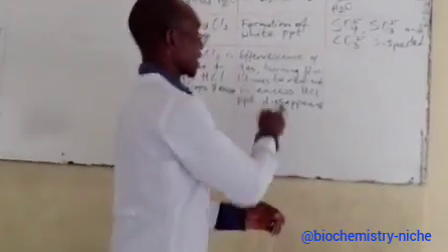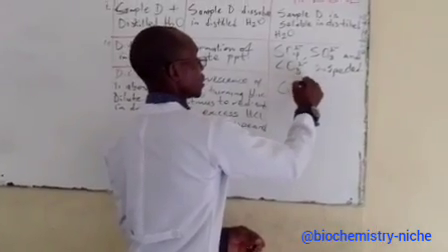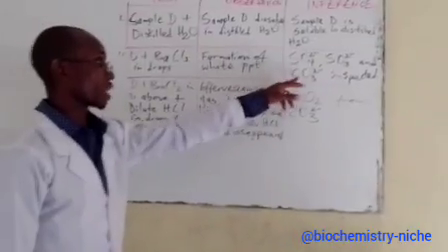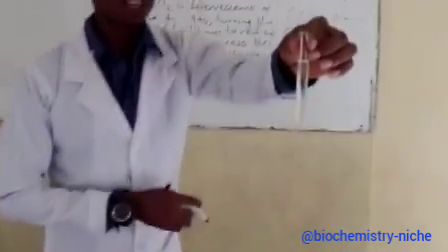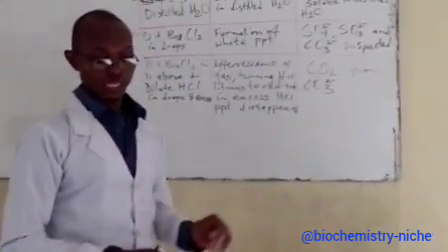So what we are having here as inference is that the gas that is evolving is possibly CO2, gotten from the carbonate that we suspected earlier on. In the second step here, we suspected that there is carbonate. From the carbonate, we are now saying that the gas that has evolved, if you still look at it, you still see there is evolution of gas, still being evolved in this substance. So the gas that is being evolved is CO2 gas. That is what we are saying here.